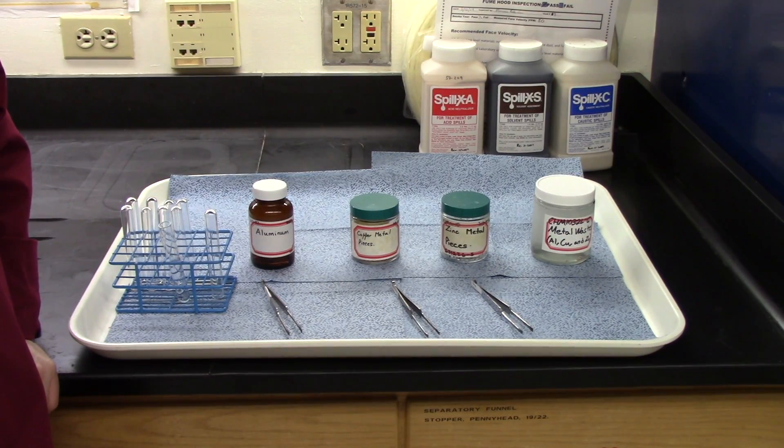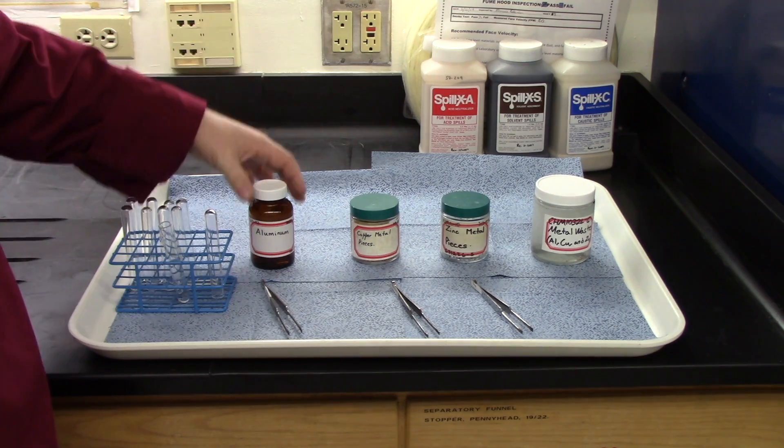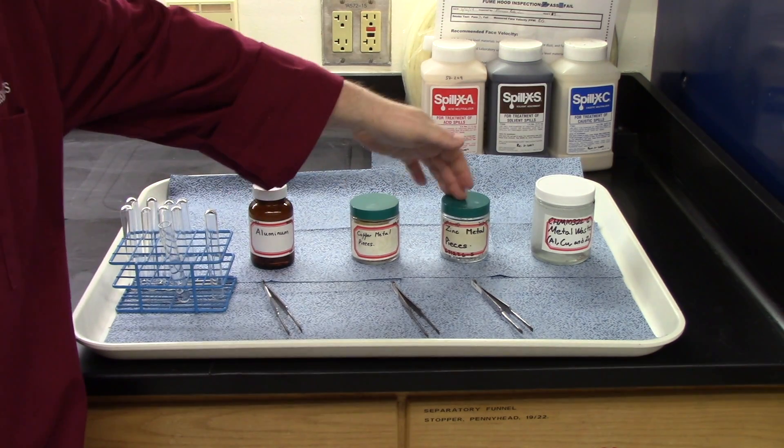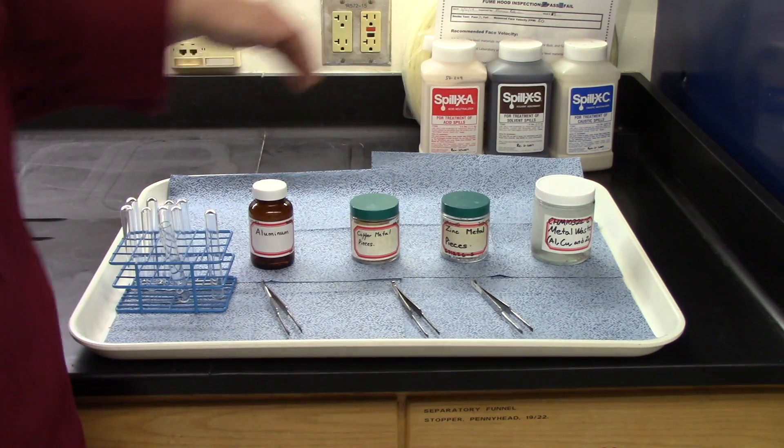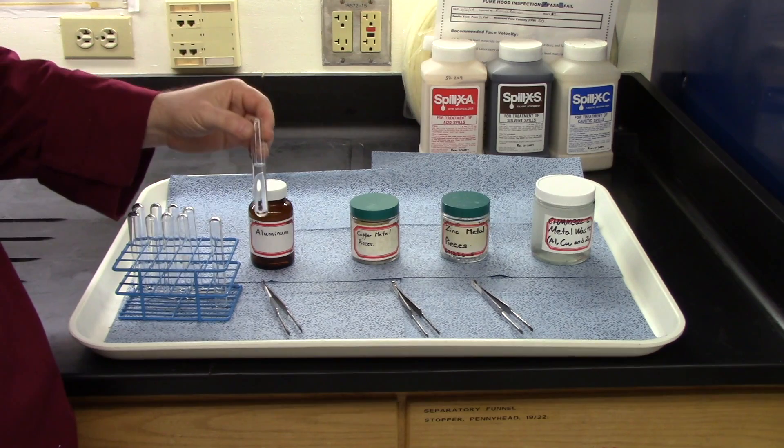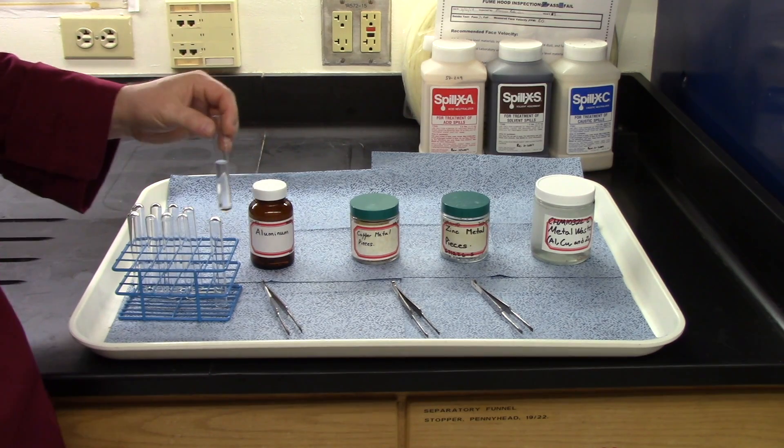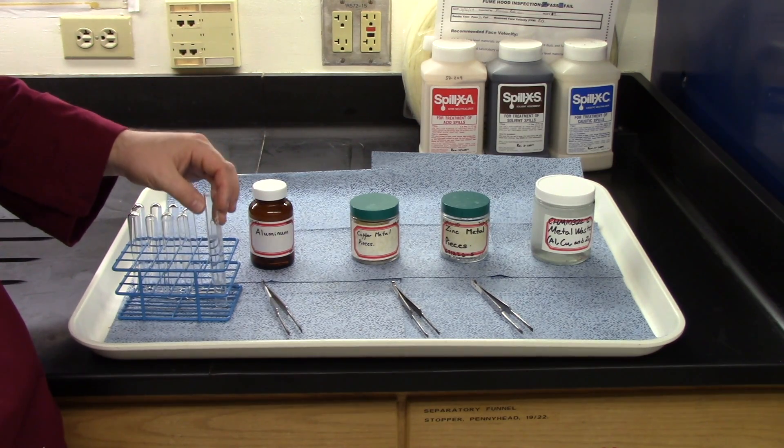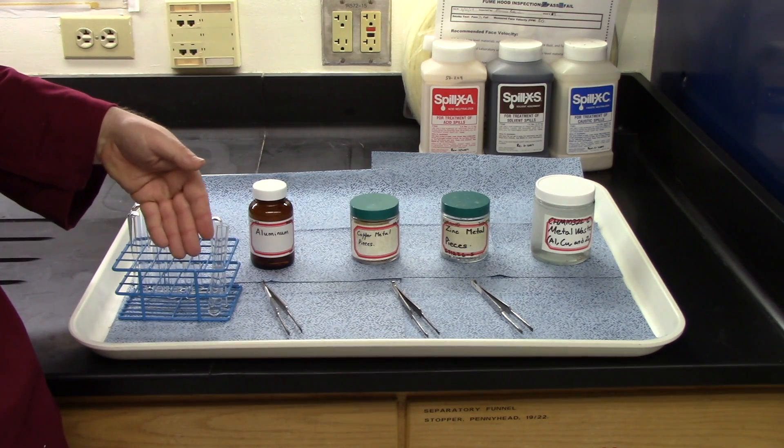This is the setup for part one of today's experiment. Here we have some aluminum, some copper, some zinc. And this is the waste bottle. I've taken my test tubes off of my bench. These are just empty test tubes. I put a little bit of acid in this one, because I want to react each metal with acid. So you want to have three test tubes with acid in them.